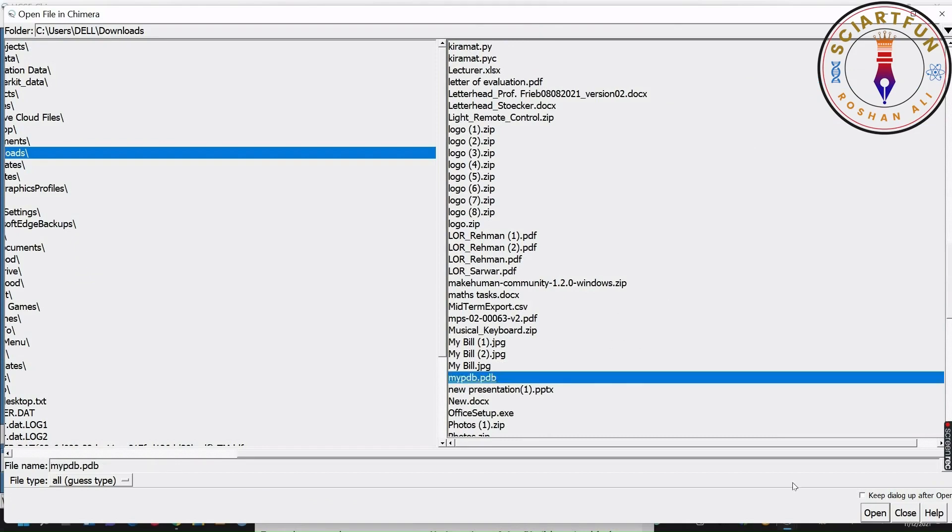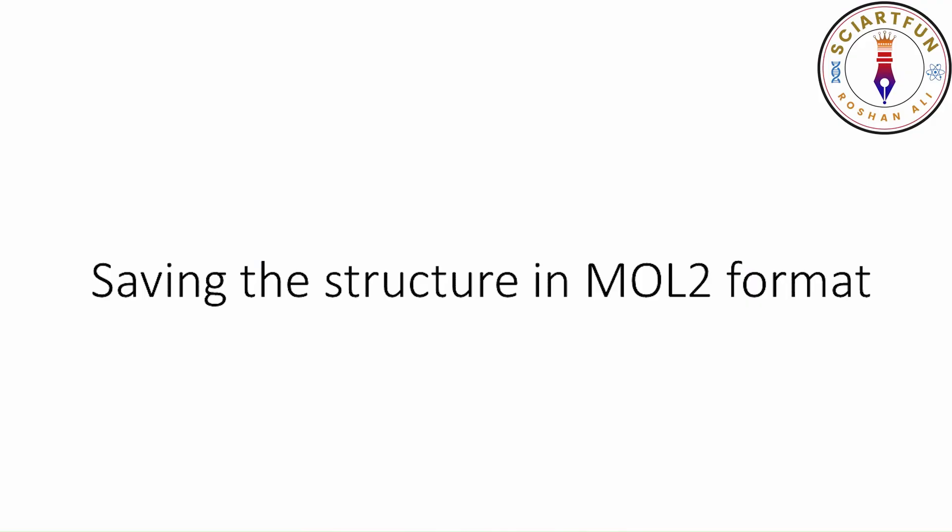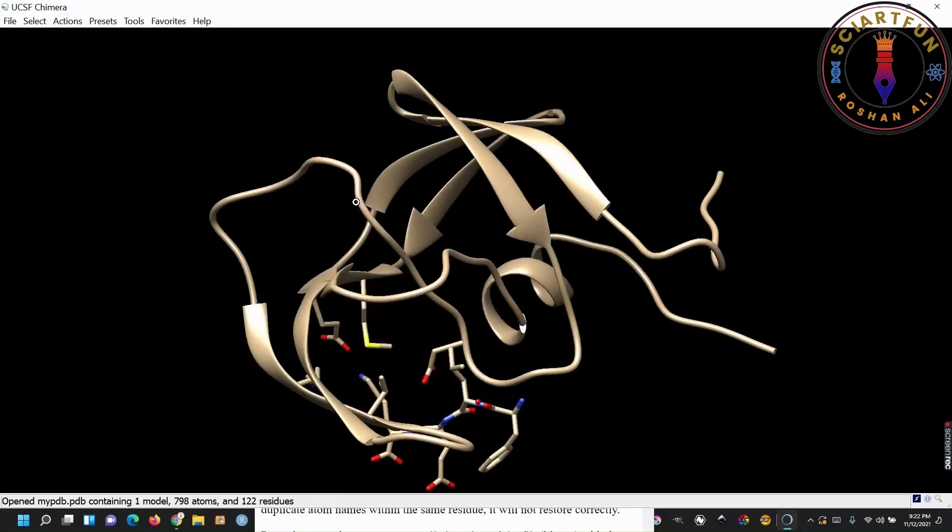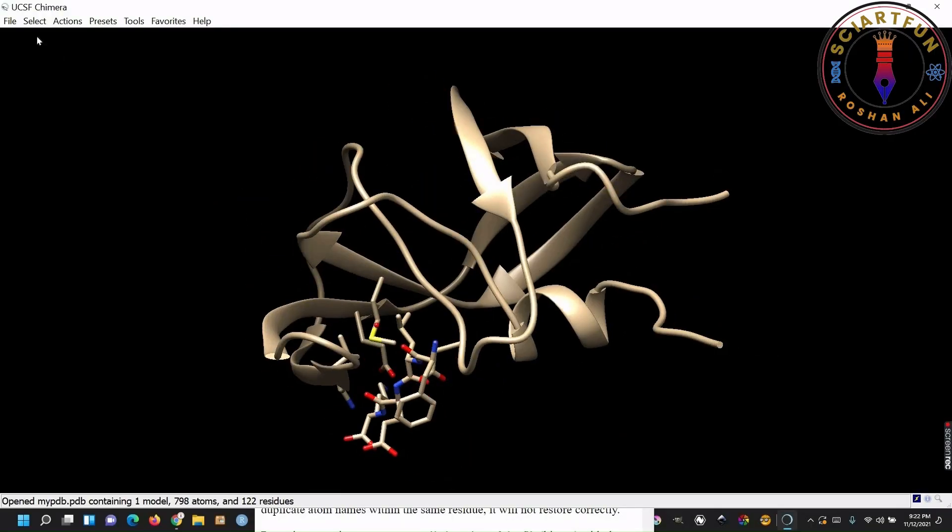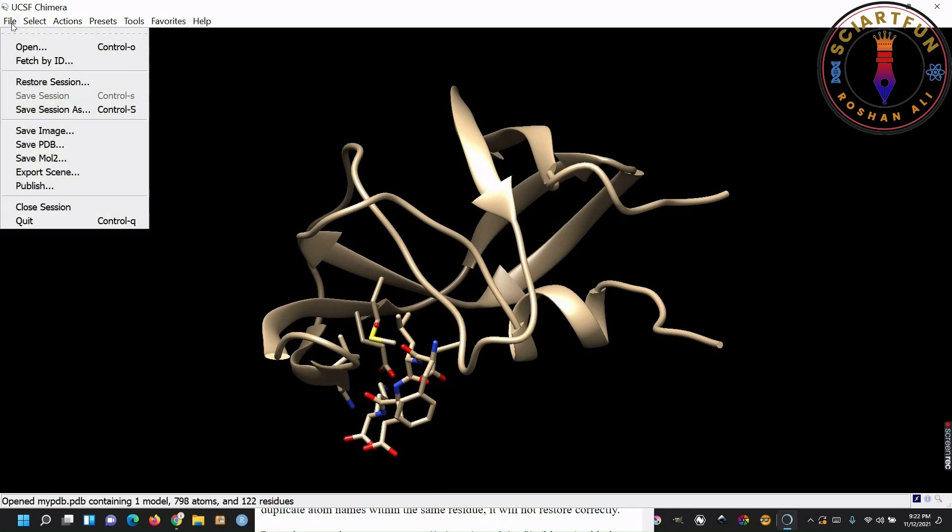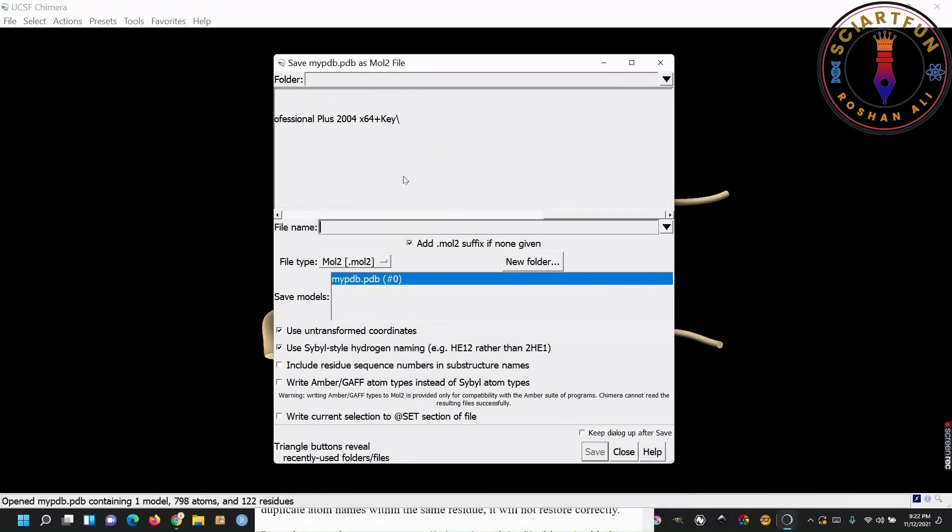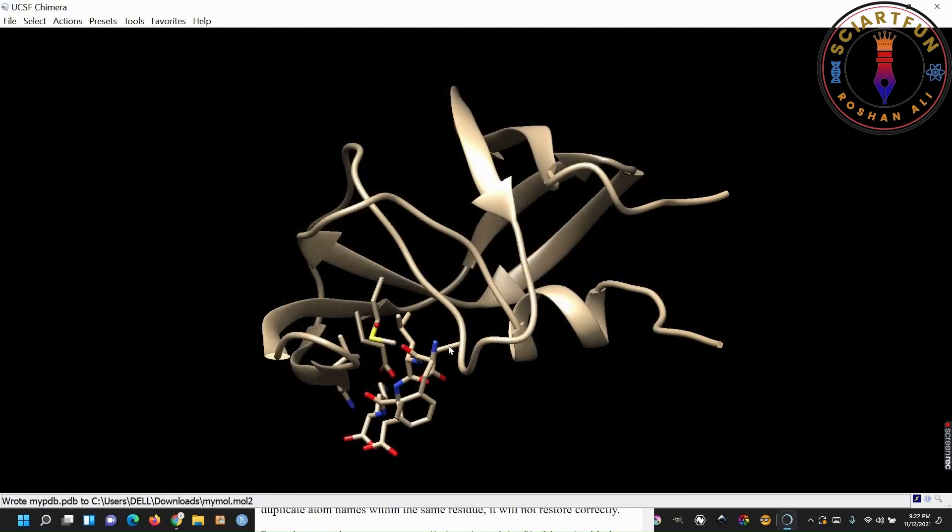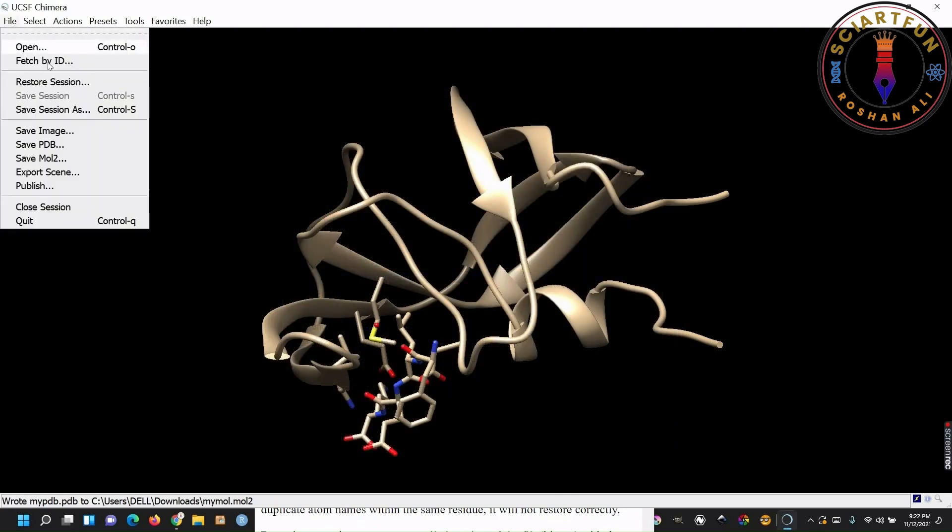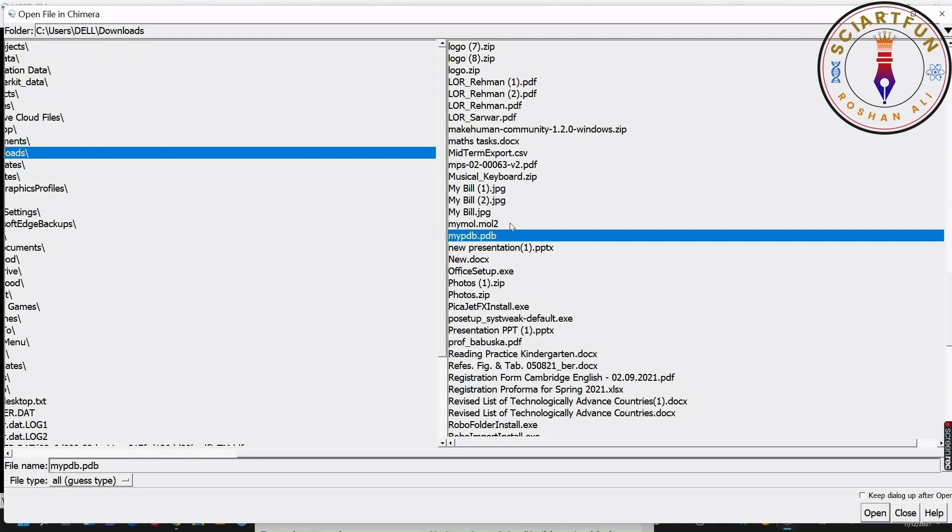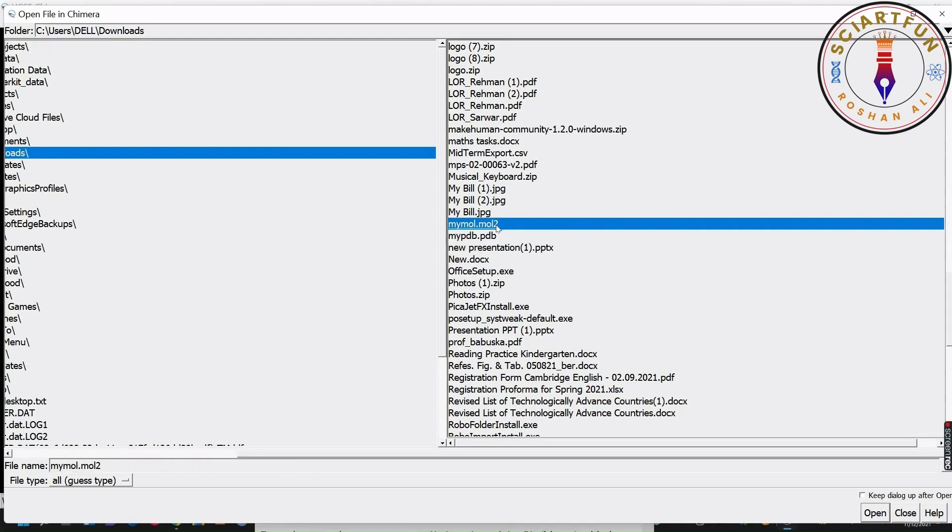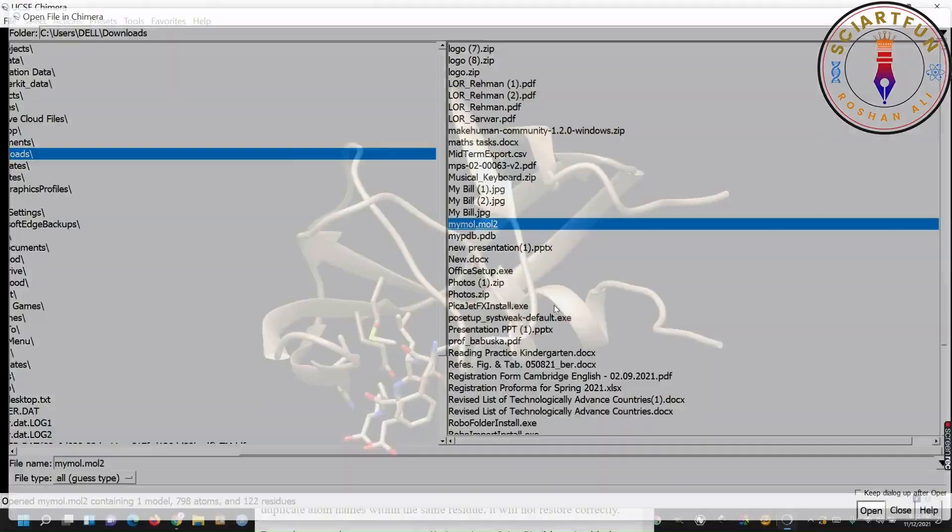This is the file we just saved. You can also save your structure in MOL2 format. Just go to file, select save as MOL2. Name the file and save it. This is the file we just saved.